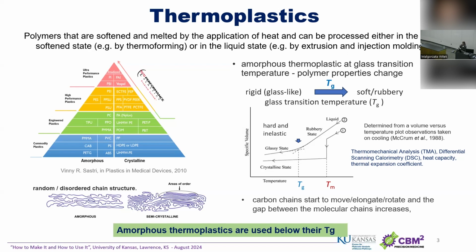So we opted to go with polycarbonate, which has a glass transition temperature of 150 degrees C, well above the 95-degree thermal step required in the processing. So that's how you match. Dr. Soper said we have a variety of thermoplastics, and you can match the thermoplastic to your application. The glass transition temperature is one of the parameters you need to consider when choosing your material.